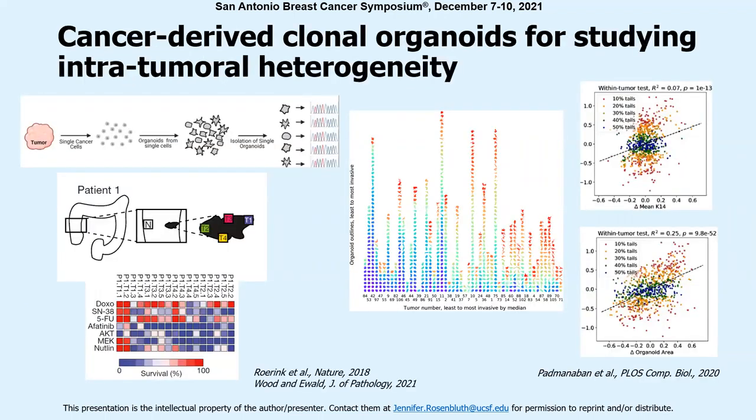There have been further studies of intra and intertumoral heterogeneity and the extent to which this can be modeled by organoid cultures, though also many remaining questions in breast organoid research in particular.